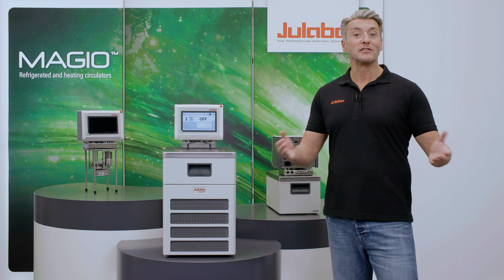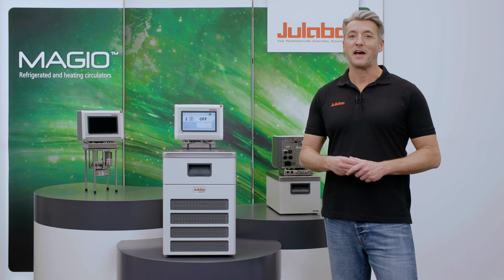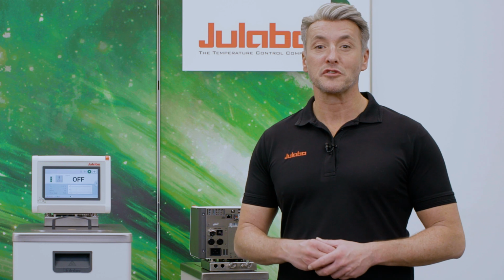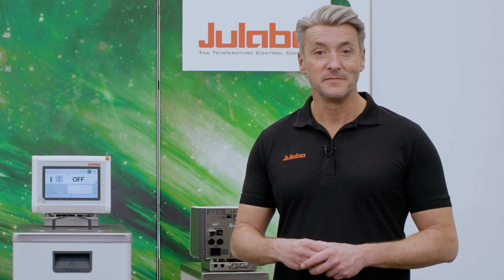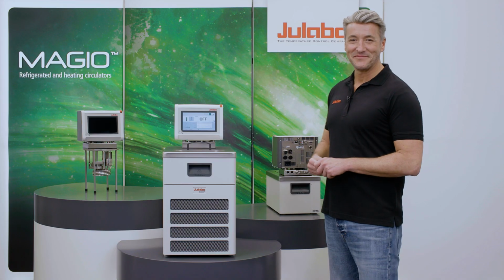My name's Alex and today I will show you how to easily and rapidly manage different user groups with our MAGIO circulators. It is possible to define 3 different user groups, each with different access rights: the basic user, the advanced user, and the administrator. Let's have a look at the MAGIO menu.